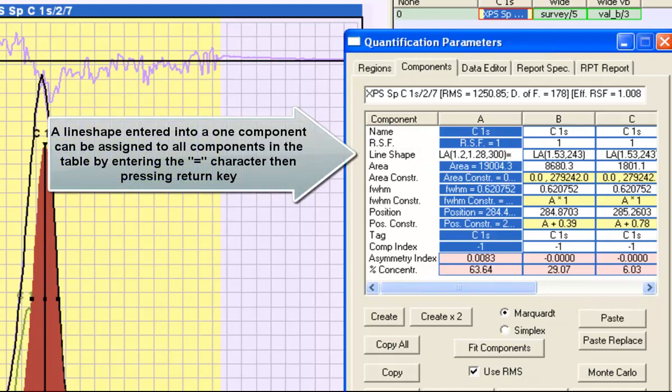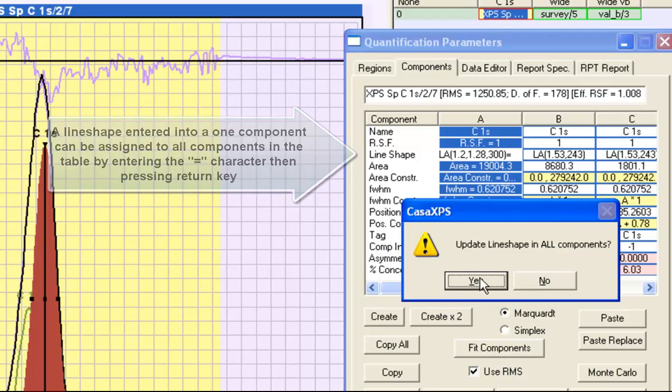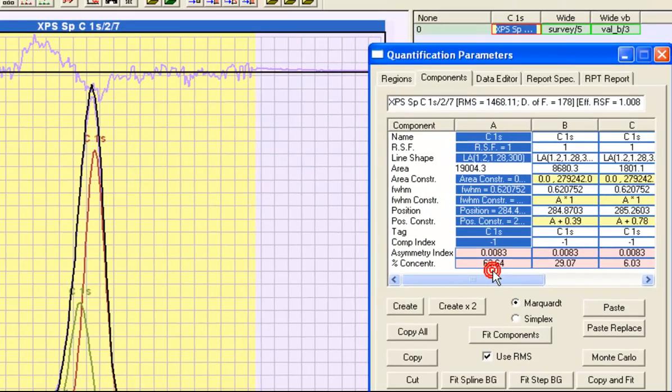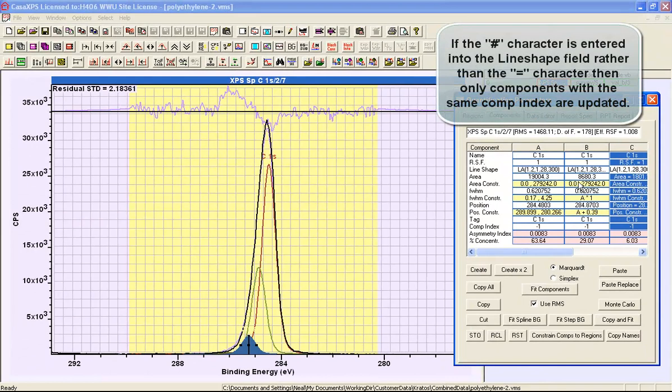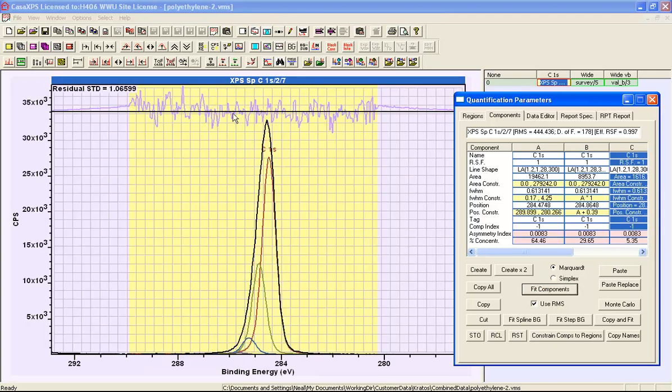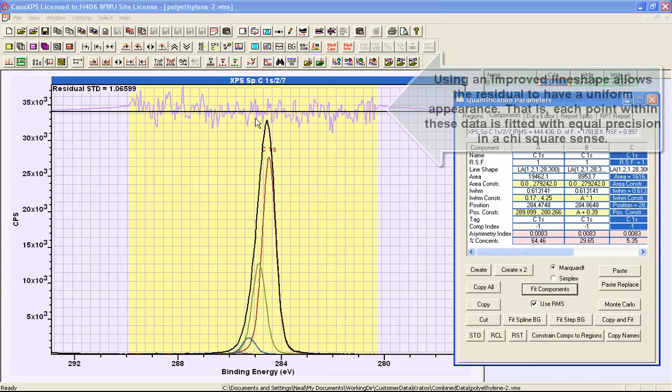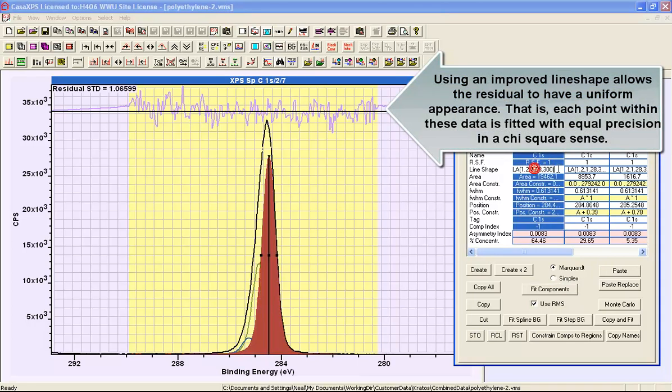If I enter equals and then press return, I can update all the line shapes on these data. So you can now see that each component has the same line shape which is consistent with the model that we were attempting to construct, that is to say a sequence of identical peaks offset by binding energy of 0.39. If I say fit, I end up with a much better fit where not just the peak maximum but also the wings are being fitted by the combination of the line shape and a sequence of peaks all with this common offset.